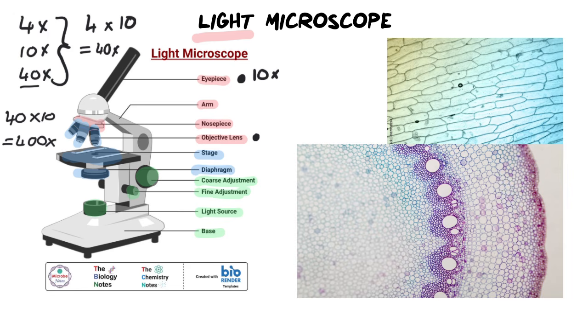What you can see here is how the cells are arranged within one another. But do you still notice that they're not very detailed? We can't really see what's inside the cells. They seem to be all clear or empty. The stronger the light microscope, the more detail we can see. But if we want to get really close, we're going to need a more powerful microscope.